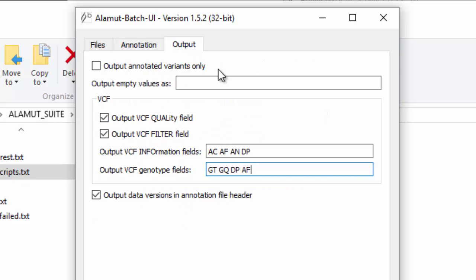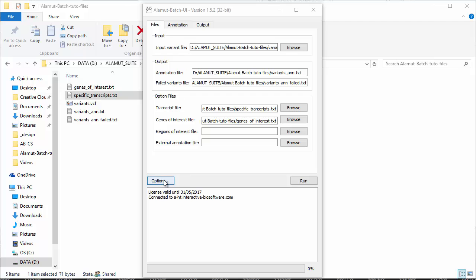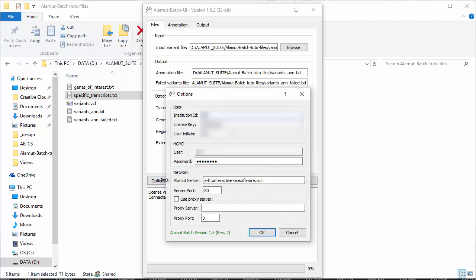The output tab allows you to specify options related to the output file. When using a VCF file as input, Alamut Batch can extract any information that you specify, such as quality, read depth or genotype fields. If you have an HGMD professional license, you can set Alamut Batch to get variant annotations from the HGMD database. Click on the Options button, enter your HGMD credentials, click on OK and restart the application.